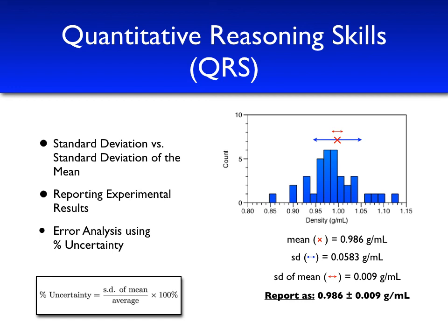Another important thing that we introduced in this experiment is propagating error. By the time we get to part 2 of our experiment and determine the mass percent of copper in copper glycinate, the error depends on 2 things. The titration we did in part 2, there's uncertainty in doing that titration. There's also uncertainty from part 1 of the experiment when determining the molarity of our sodium thiosulfate.